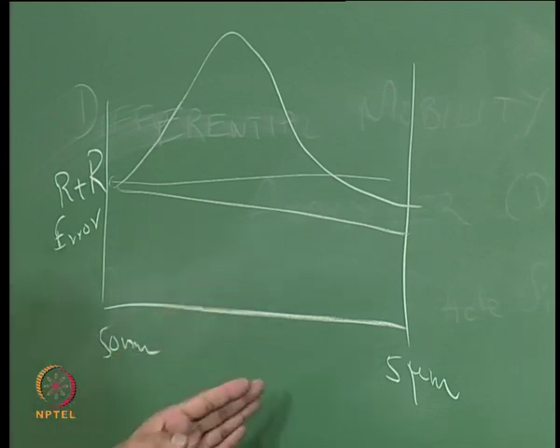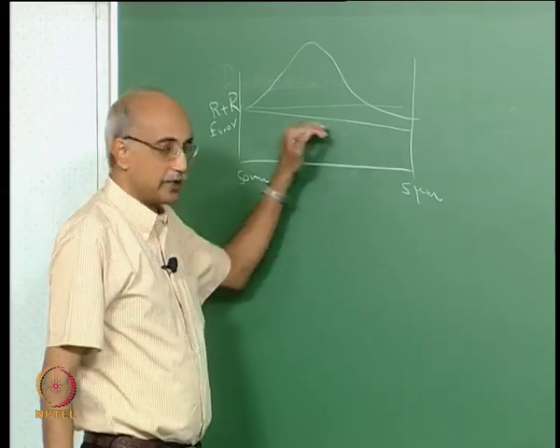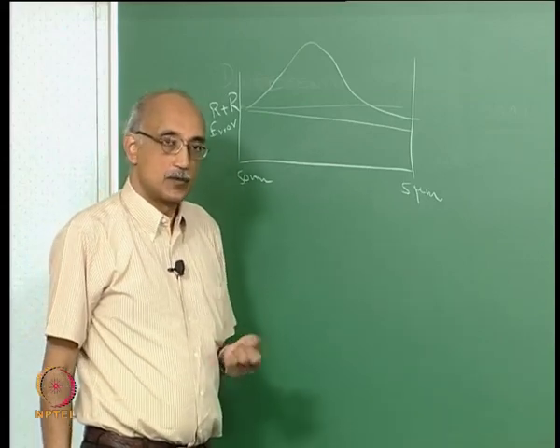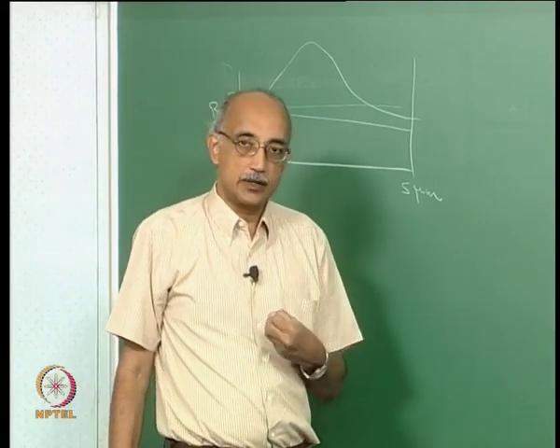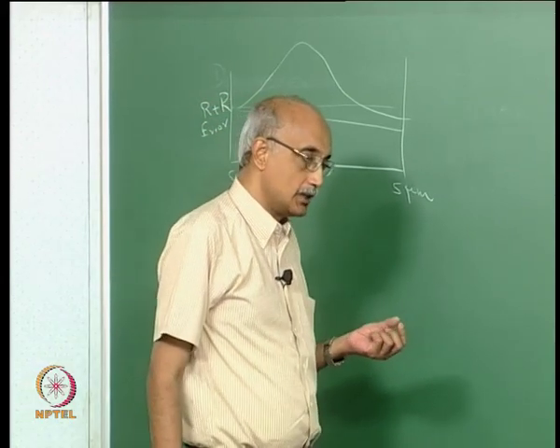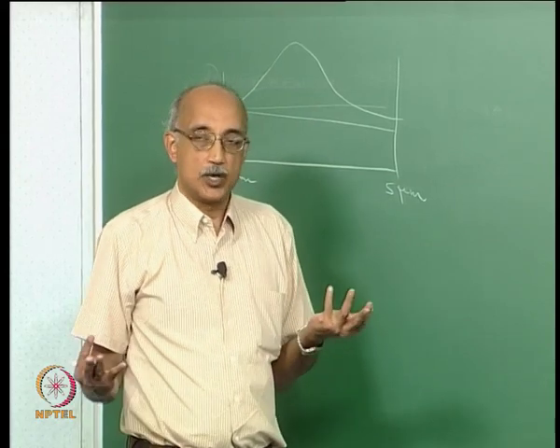What you would like to see is a nice gradual and linear dependence of this parameter on size. Given that in a particle counter, it is more difficult to count and size finer particles compared to larger particles, this is the kind of behavior you would expect, that the error would slowly decrease as you go to larger sizes. However, there is the other factor that as the particle counts decrease, the error will increase. Now in nature, we have a tendency to see that particle counts always follow a certain pattern.